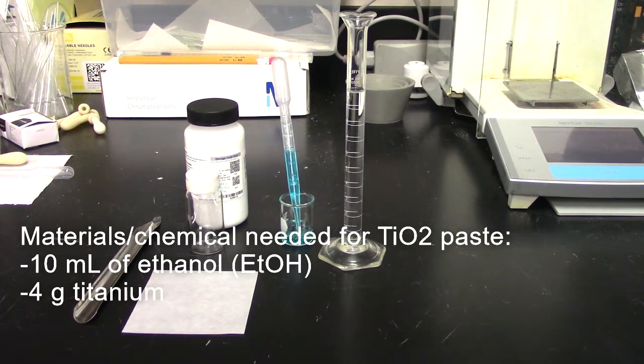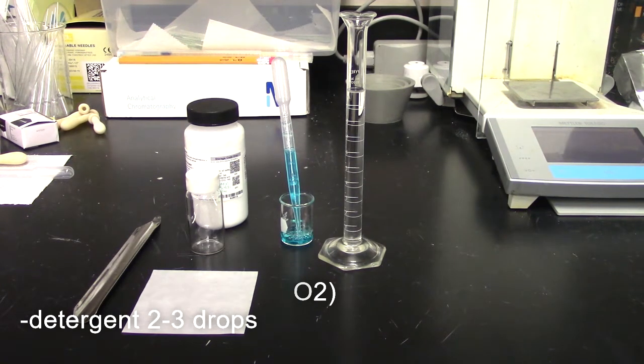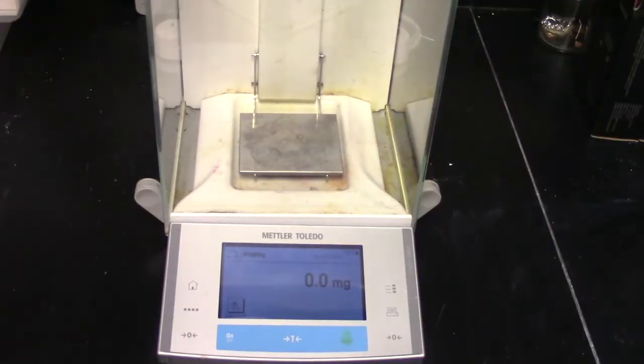Begin by obtaining the needed materials and chemicals for the TiO2 paste preparation: 10 milliliters of ethanol, 4 grams approximately of titanium dioxide powder, and 2 to 3 grams of detergent.